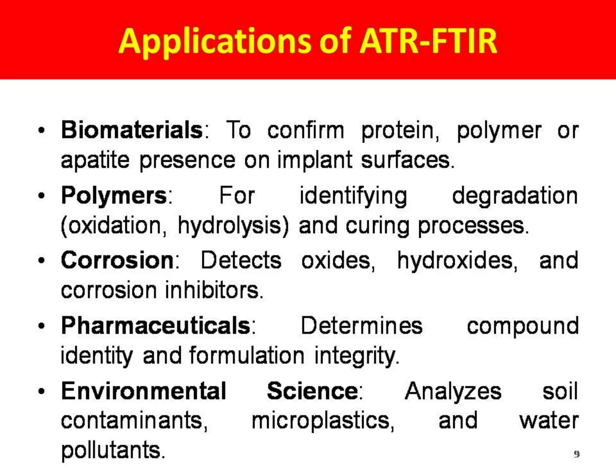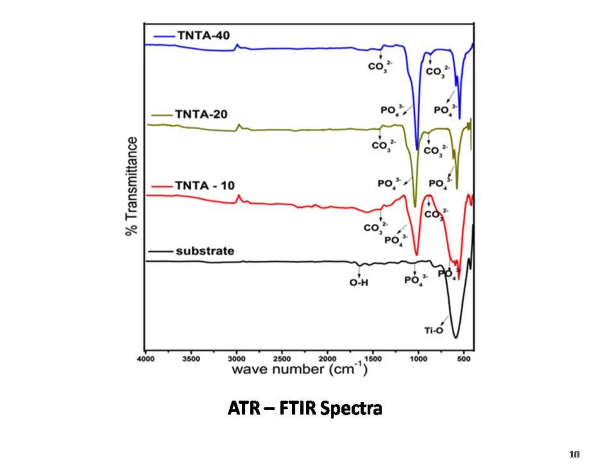Then in environmental sciences, analysis of soil contaminants, microplastics and water pollutants, etc. So this is a typical FTIR spectra obtained for titanium nanotube arrays at different water contents.